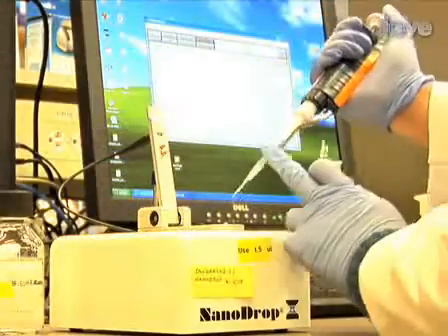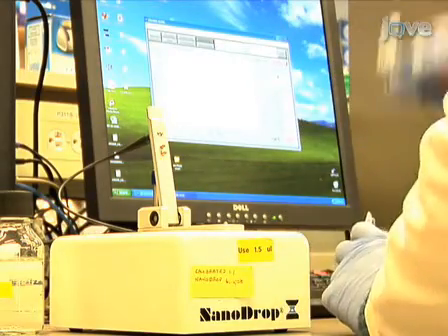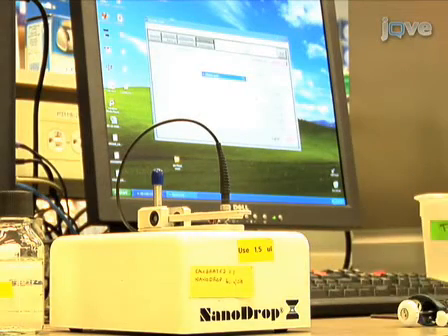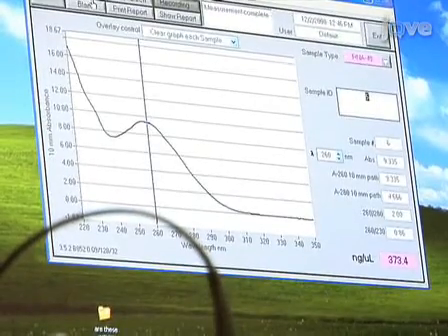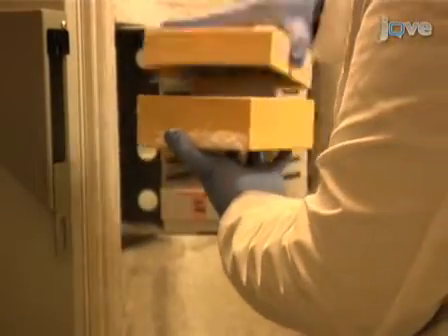Check the RNA concentration by spectrophotometer. Traces of phenol or BCP can be detected as a spike at 270 nanometers, beyond the standard peak at 260 nanometers, when measuring the absorbance of total RNA after extraction. If such contamination appears, re-extract the RNA using a filter or column-based RNA extraction method before proceeding with amplification. You can store the RNA sample at -80 degrees Celsius.